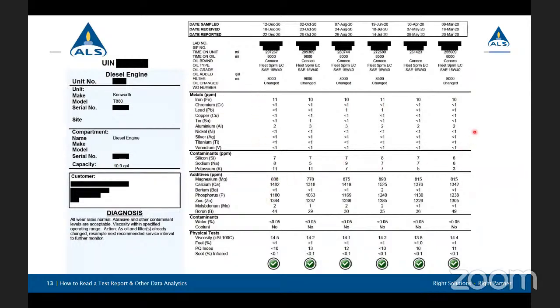We've got really good wear rates up here. They're very low. They're very consistent. And then all of the physical properties are very consistent down here. So this is a really good report. This would be something you could look at for just a few seconds and move on, because there's not a lot of attention needed.